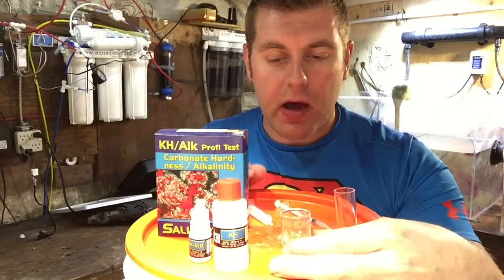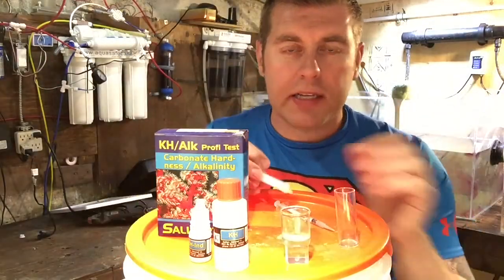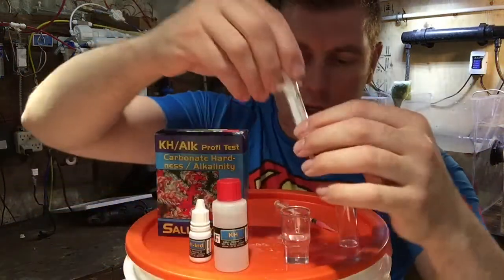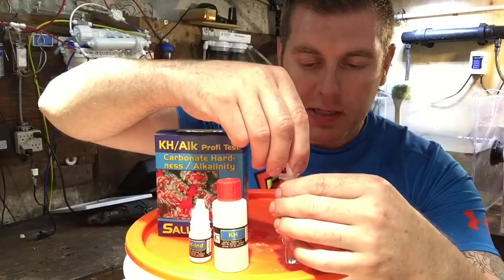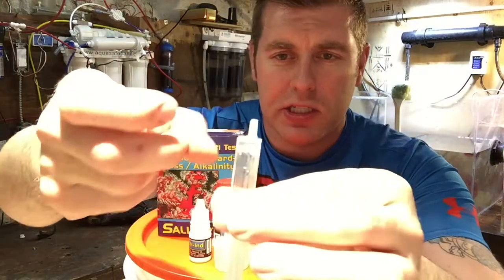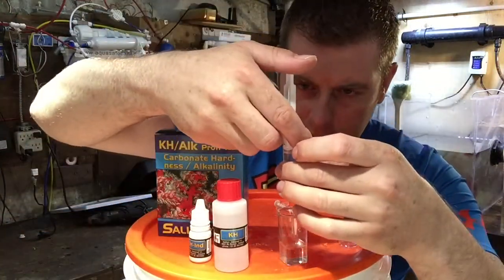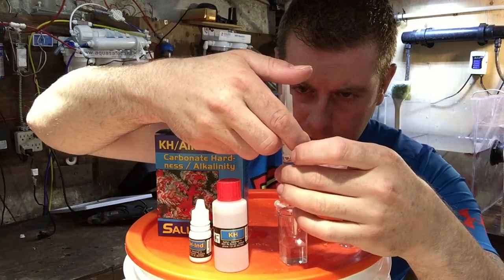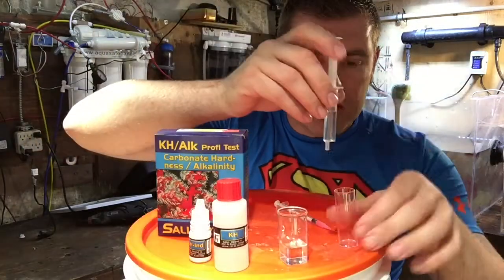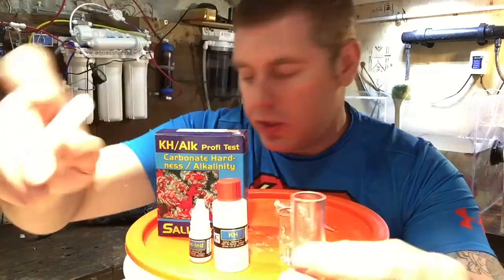I just got a water sample from my sump from my reef tank. The next step is to fill the five milliliter syringe to the four milliliter mark using that test water. Make sure to get all the air bubbles out — just tap it. Once you have four milliliters, add it to the test vial that comes in the kit. Now put the syringe aside.